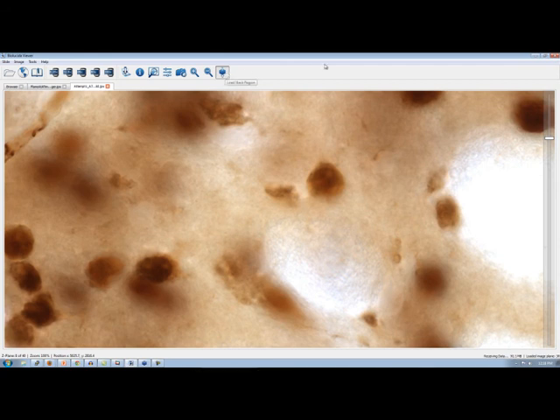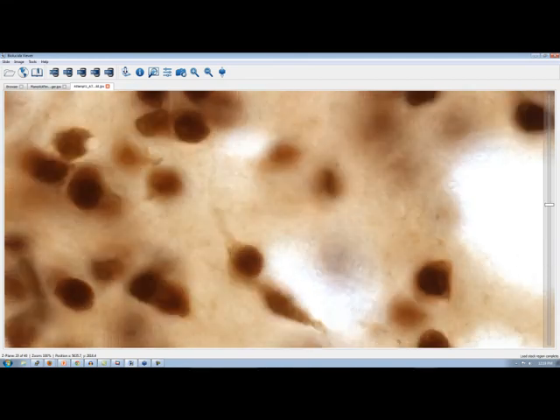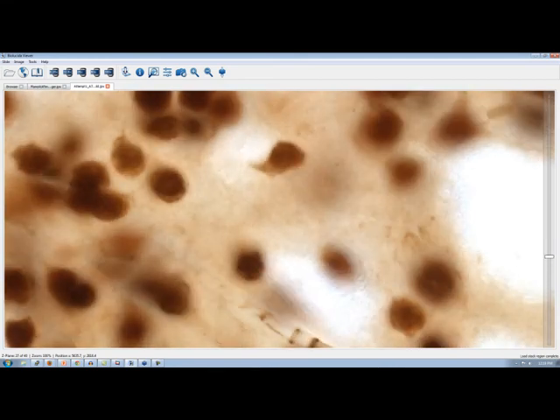So Jeff, I think it's important to point out here that what you're doing is essentially creating an ad hoc image stack. The file that you're looking at is one large file, right? A virtual tissue in 3 dimensions. It's no longer a bunch of individual stacks. So you go to a location where you've chosen a field of view, and you create a kind of core, as if you were digging through ice, and get all those layers out and create one image stack, right? Exactly. So we have a really large file here. We went to just the region that we were interested in. We hit Load Stack Region, and that allowed us to focus up and down at the full resolution for that region. It's not for the entire image, just for the region that you're interested in.